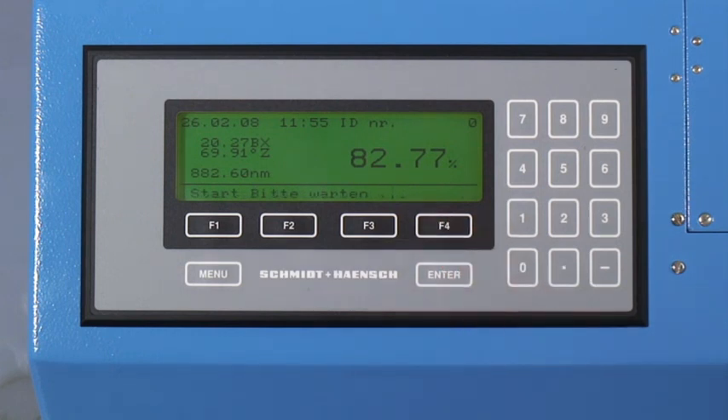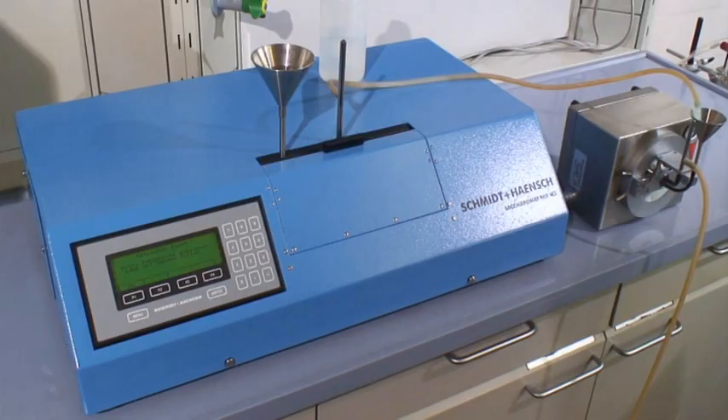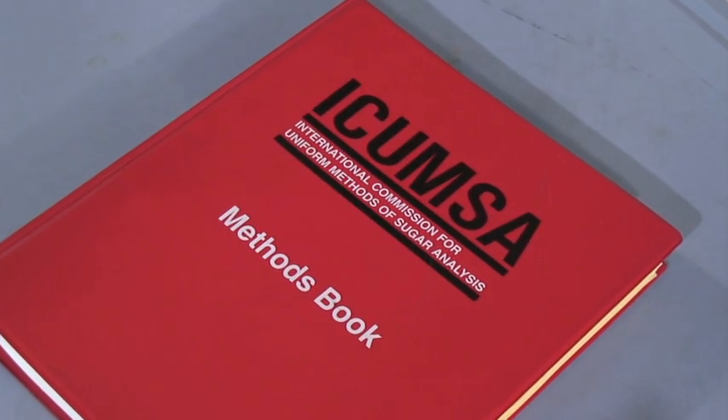It has been proven that it does not make sense to repeatedly flush with distilled water between measurements. Before ending a measurement cycle, the tubes should be filled with water in order to avoid the formation of sugar crystals inside the tube. The presented system consisting of the Sacramat or the Polytronic M-series and the refractometer is the most compact purity measuring system that immediately calculates the results of the measurement — the pole and the Brix — into the purity of the sugar solution.